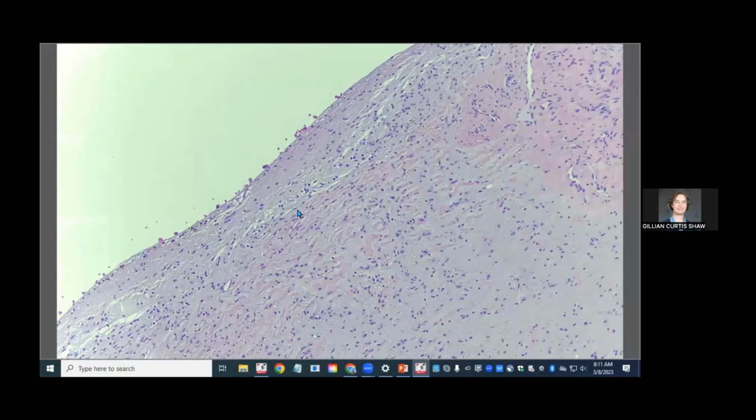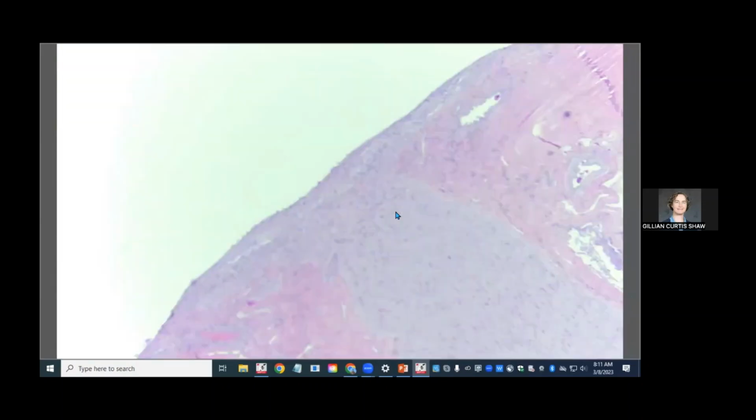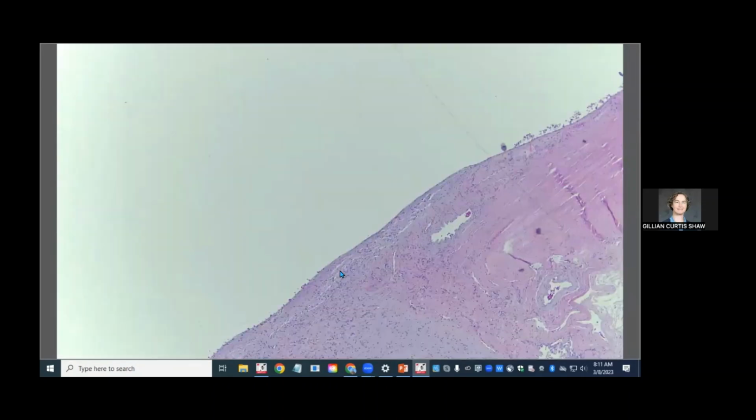So they nucleated this eye for glaucoma. We didn't sample the retina very well, but the optic nerve head, which is probably a little bit tangentially sampled here, is a bit gliotic. And the lamina cribrosa right here is maybe a little bit recessed from the choroid, but once again, the choroid is so hard to discern in this eye. Anyway, so let's go back up and look at the lens.